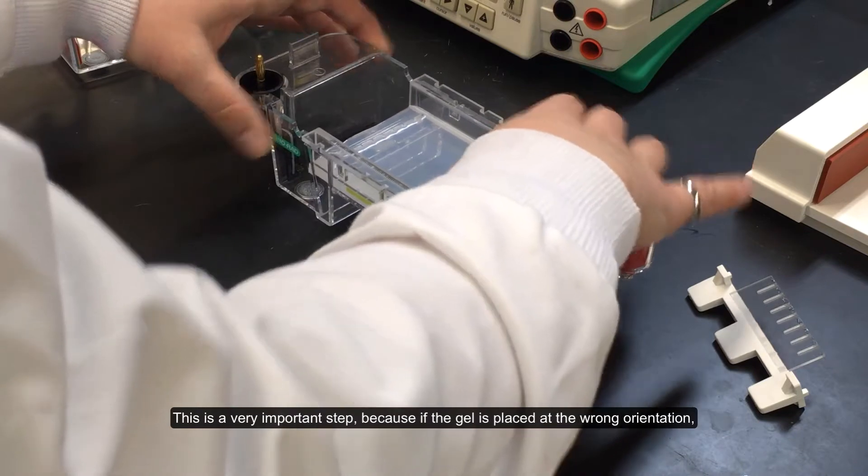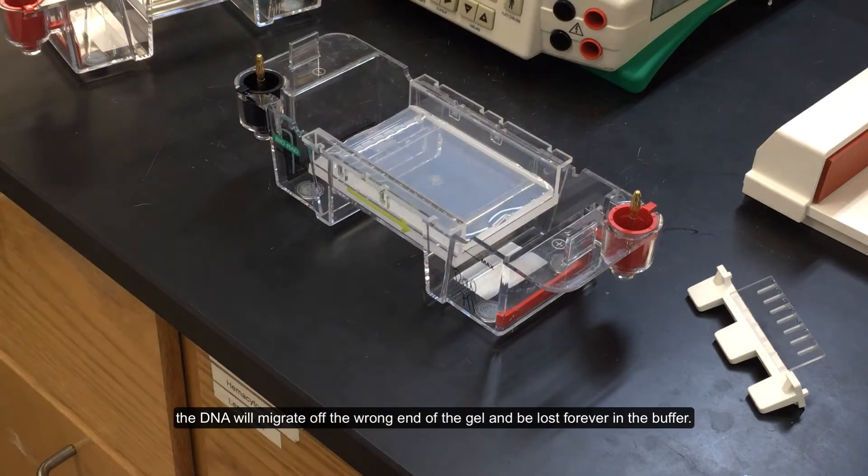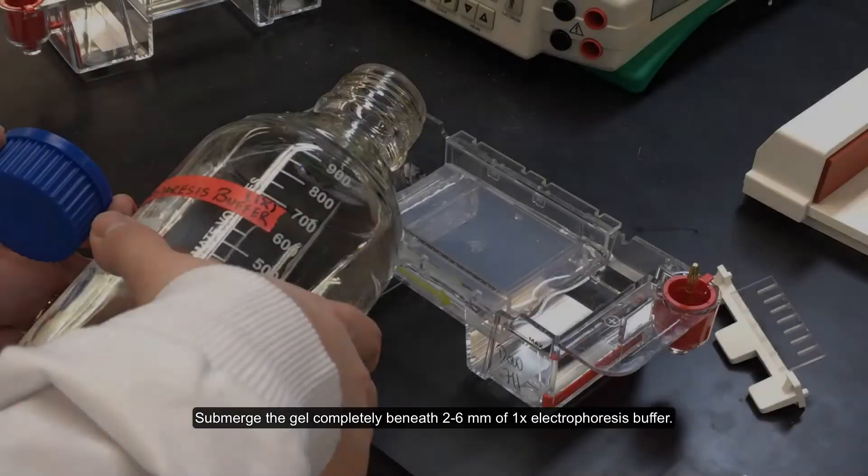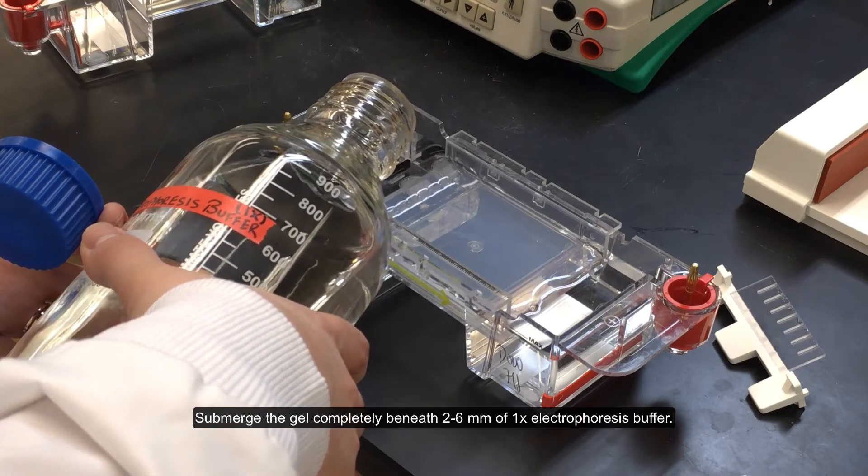This is a very important step, because if the gel is placed at the wrong orientation, the DNA will migrate off the wrong end of the gel and be lost forever in the buffer. Submerge the gel completely beneath 2-6 mm of 1x electrophoresis buffer.